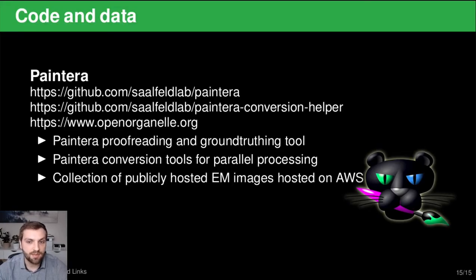As we continue developing Paintera, we want to make sure to provide a robust tool that can be used for effective annotation of large volumetric datasets. Some of our near-term goals are to increase the label lookup performance by utilizing a database backend, as well as adding more painting modalities and more opportunities to take advantage of virtual images. We're also aiming to improve our release process to make installation and updating as seamless as possible.